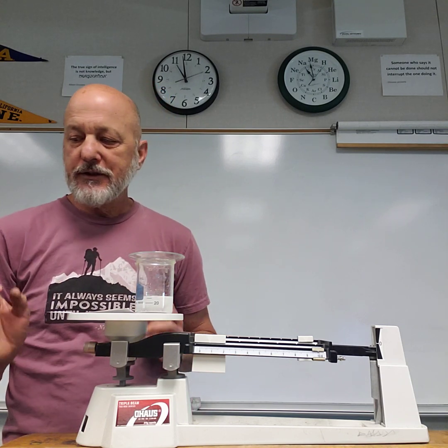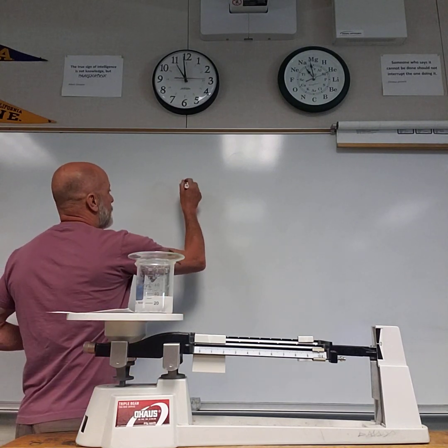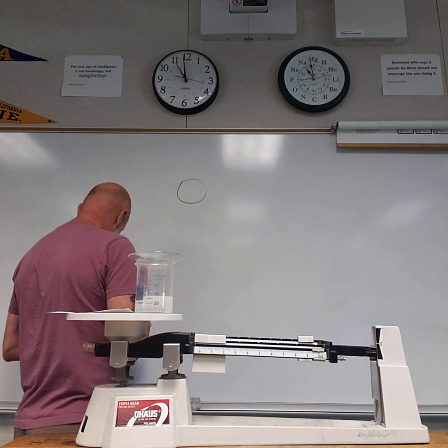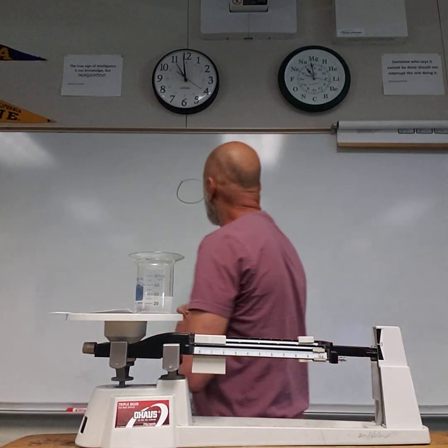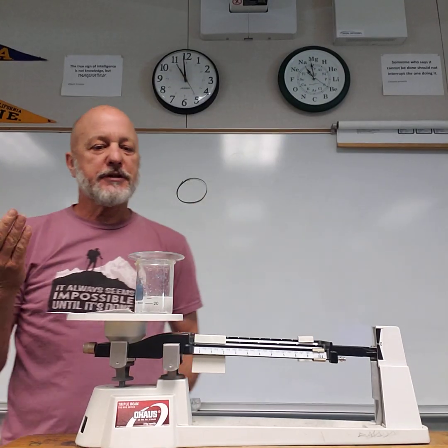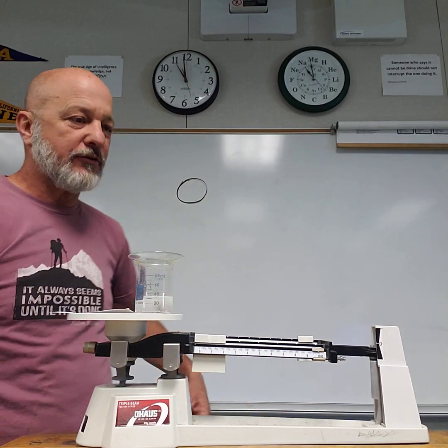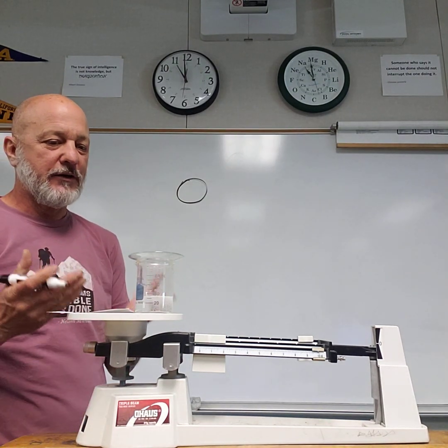So one of the things I mentioned in the last video, the difference between, so in science, it is a giant mistake to go into an experiment saying, well, I don't think there's going to be any change of mass, so I don't see anything, zero. That's really not how we're going to do this.